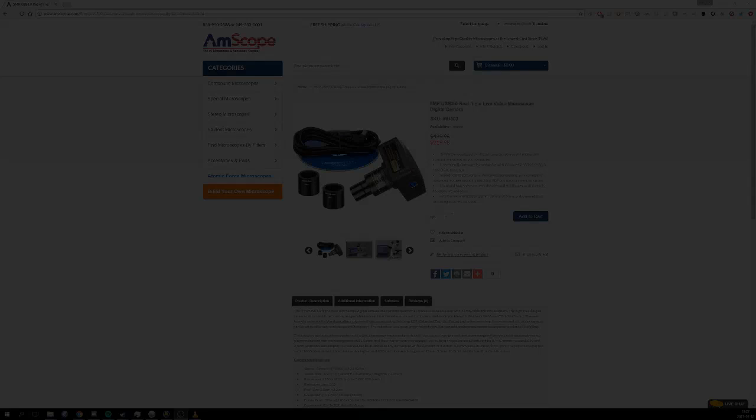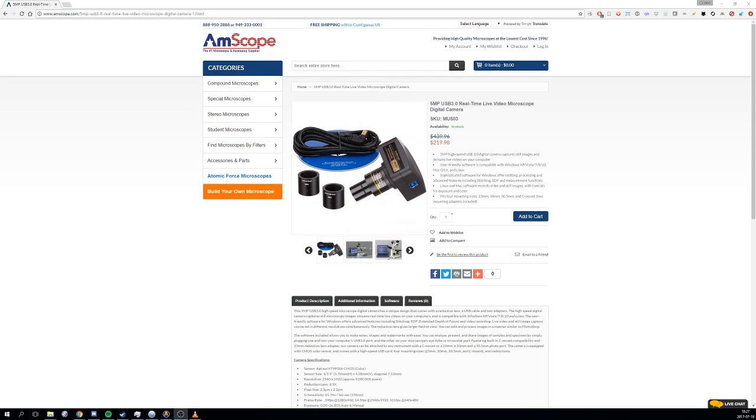Okay guys, so tonight we're going to talk a little bit about a microscope camera, Amscope MU503. The Amscope MU503 is a 5 megapixel USB 3 camera that is capable of producing real-time live video from your microscope.